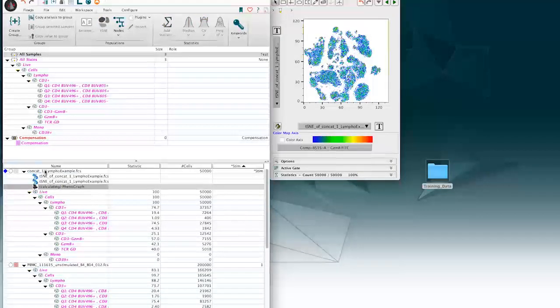So this is what's going on, right? Export the file into essentially an extra folder that gets created. It's called the plugin derivatives folder. It delivers that to R, and then it returns back the clustering results. It's going to say calculating while it's doing that process, and it's not going to be immediate. You're going to have to take 30 seconds, maybe 2 minutes to do the clustering on it. So I'll let that run.